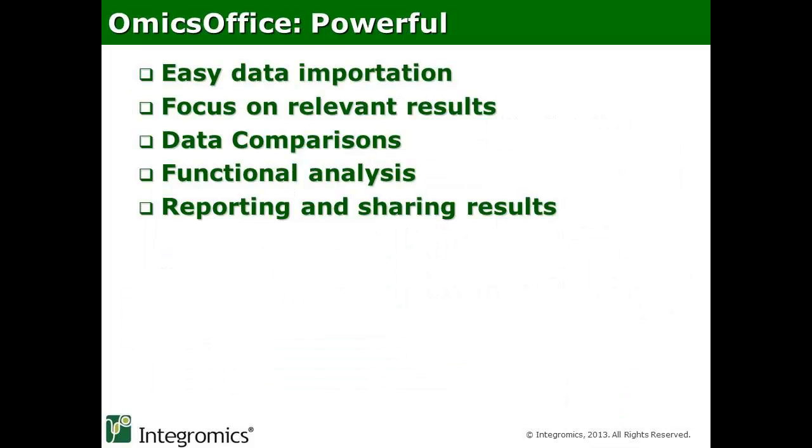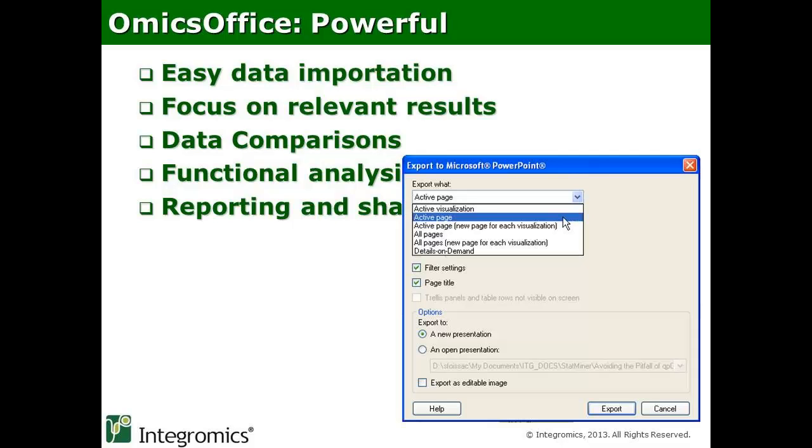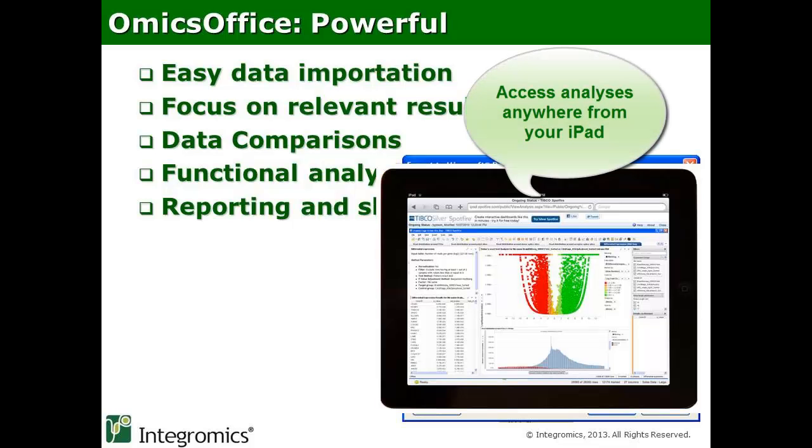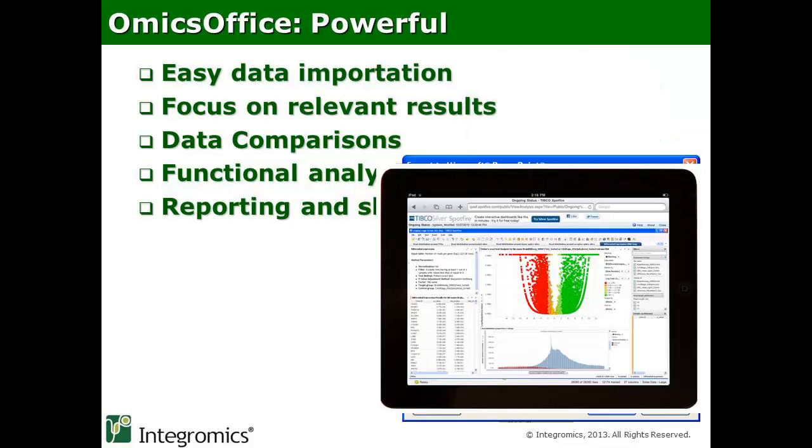Once the analysis is completed, we can easily share the results in PowerPoint or in the form of an interactive web player. This allows our collaborators to further add to the data analysis and provides them with a much better feel of the results than any flat file figure can convey.